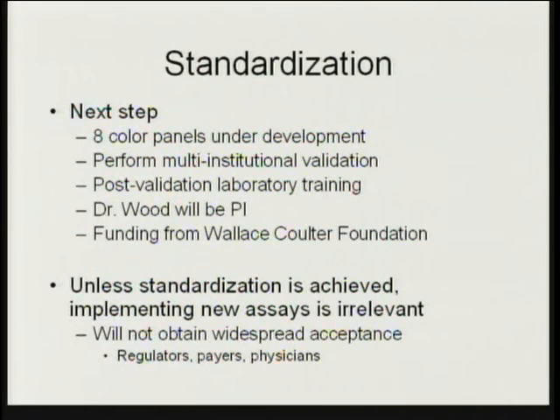The next step in this process is to develop an actual reagent panel. An 8-color panel is currently under development, and to perform a multi-institutional validation study to show what the true sensitivity and specificity are of this panel of reagents. Then, when this is done, to do a post-validation laboratory training exercise to bring people in and train them to do this methodology so it can be disseminated to laboratories throughout the world. This project is currently in the planning phases.